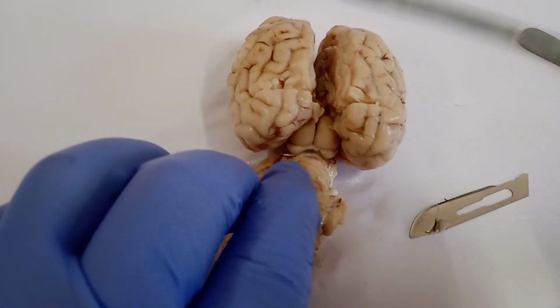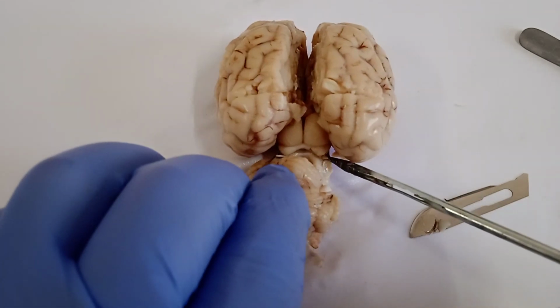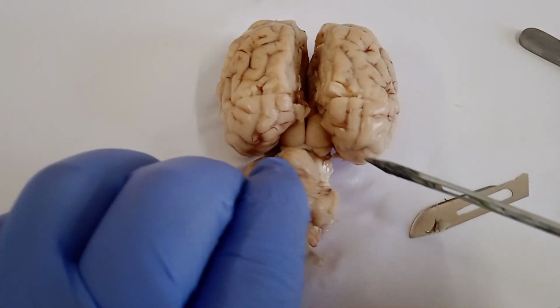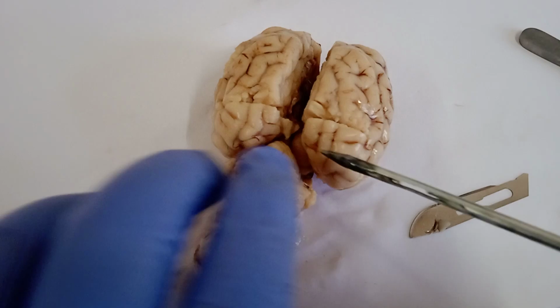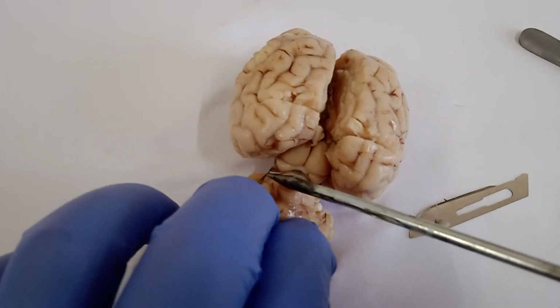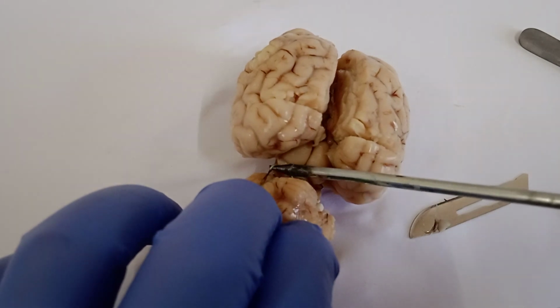So it will be coming this way. Because it is a pair, one will be here and one will be here, this way. So this is the only nerve that is coming on the dorsal aspect of the brain. The rest of the nerves are usually present on the ventral aspect of the brain. You can see this is the fourth nerve, the trochlear nerve here. You can see it.